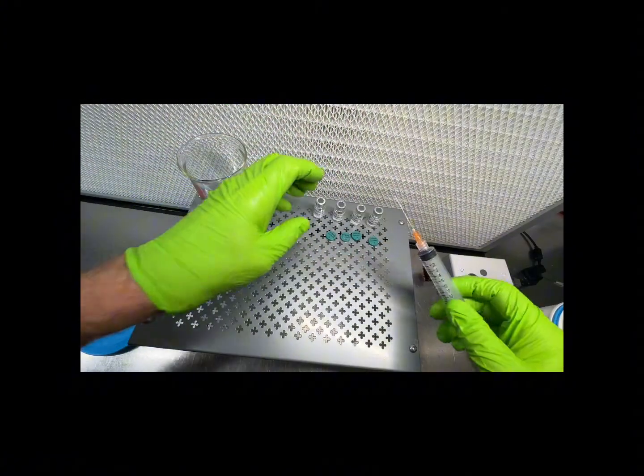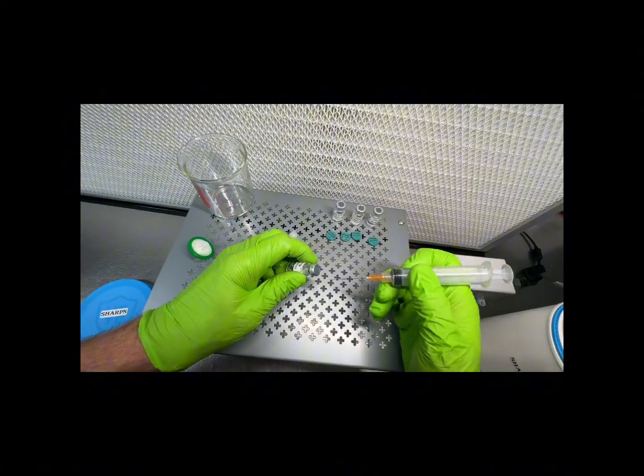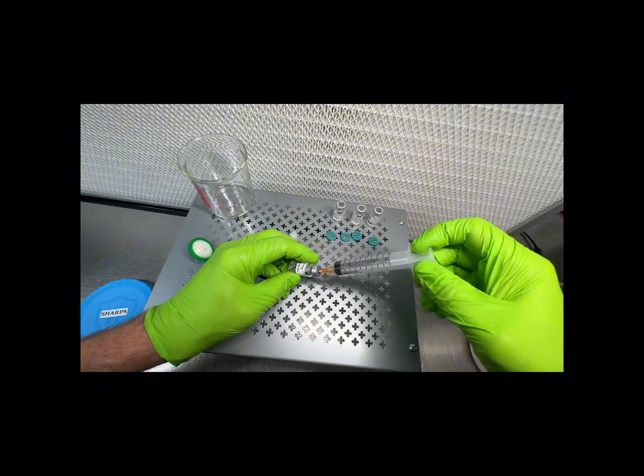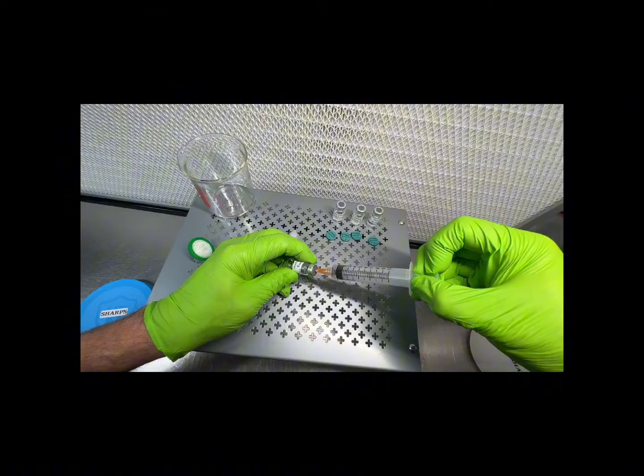Okay, it's been about 10 minutes. I let everything dissolve really well. So now I'm just going to draw the contents of each one of these vials into this syringe, and then we'll put the filter on and see how it does here.